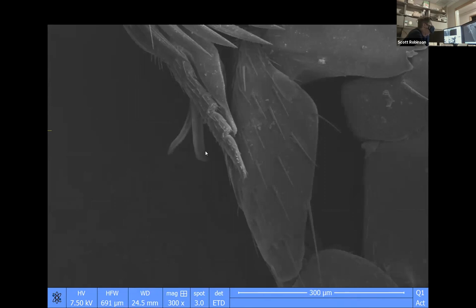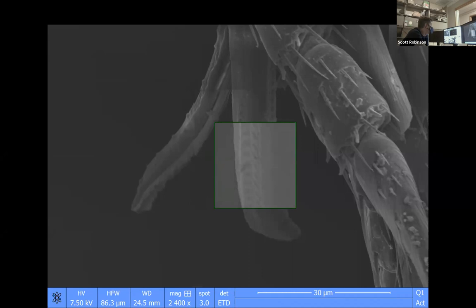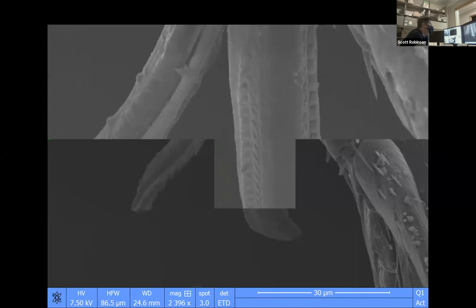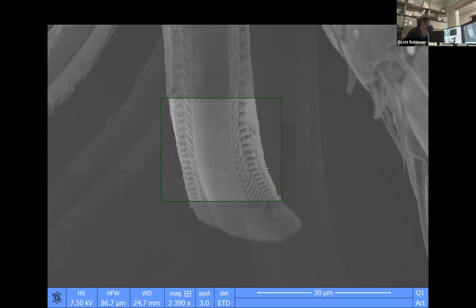And the proboscis, so fleas will bite you, and they have these little features called lacinae. And they're really kind of creepy. It looks like, if we get to pull the contrast and brightness up on this as well, it's kind of like a chainsaw blade. So this is one of the biting mouth parts. It has this really rough, sharp edge that cuts into your skin when it's biting you. And then they can suck blood that way.